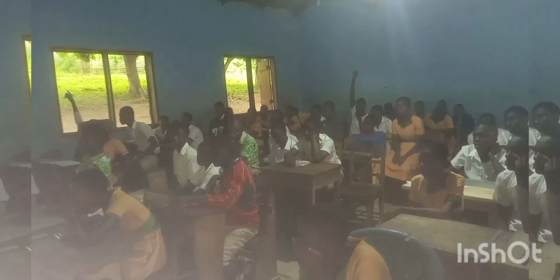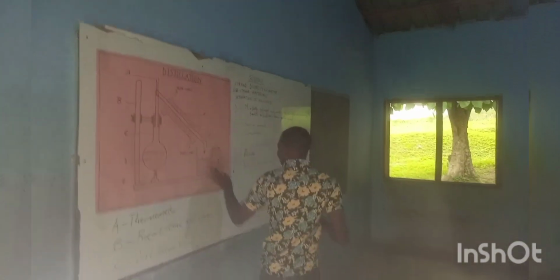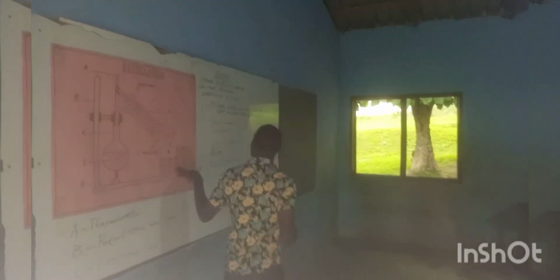Then after the distillation, what will be found here? Distillate. Yes, we know it's distillate. So I should write alcohol. The distillate you mentioned earlier. Okay, so the general name is distillate, right? Okay, so the alcohol will be here.